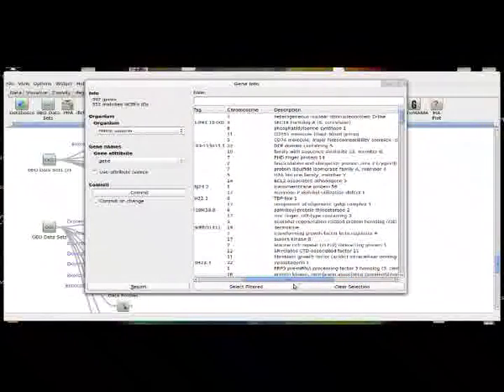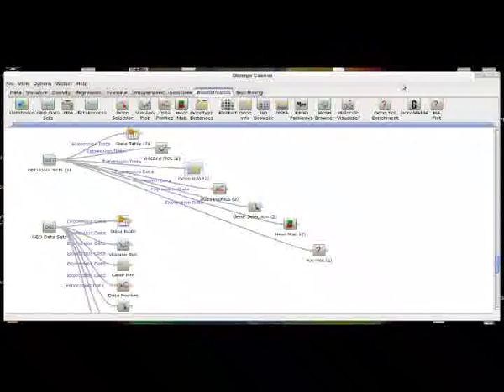So this is great. We're looking at a gene and it's showing itself to be statistically significant, and rather than go and Google it, we can just stay right inside our platform and look at what this gene does and determine if that, in our mind, is part of some sort of molecular pathway that might be of interest in looking into further in a lab setting. So the idea is we're doing all this bioinformatic research, we're looking at all these genes, we're trying to figure out what's causing these diseases or these differences in tissue types, etc. This gene info widget makes it much faster for us to go through and identify genes of interest by determining why these genes are getting the expression levels they are in the context of our problem.